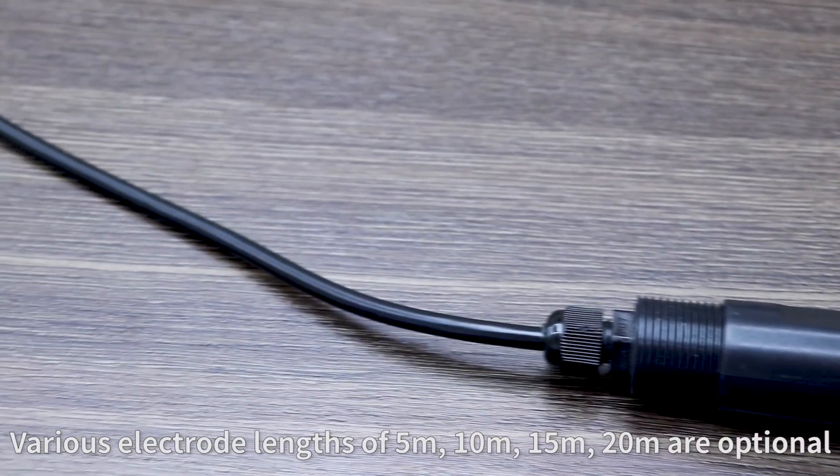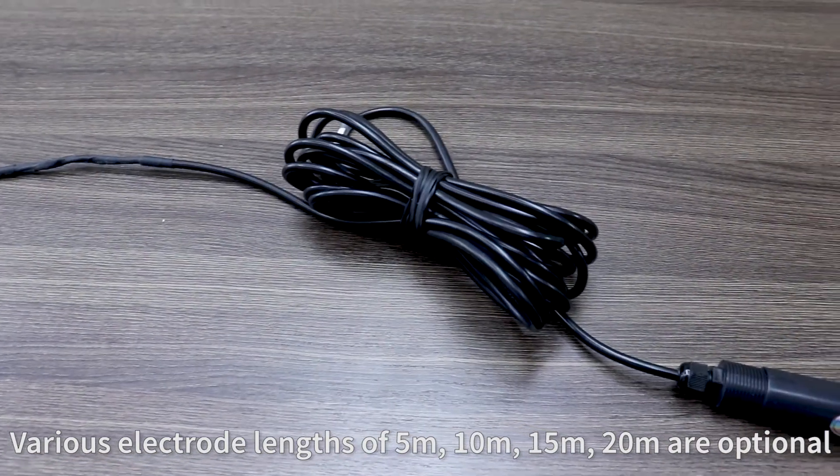Various electrode cable lengths are available, including 1m, 10m, 15m, and 20m, all optional to suit different installation requirements.